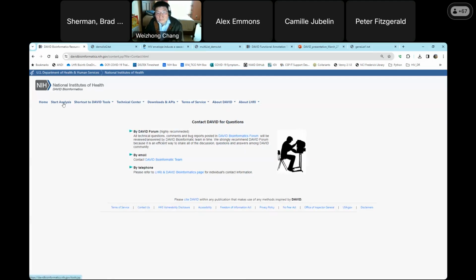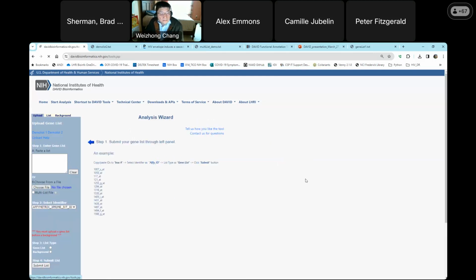So what we're going to do is start an analysis. Hopefully this goes smoothly and quickly. So we'll click on this Start Analysis, which brings us to the analysis wizard. And the first thing that DAVID wants us to do is upload a gene list.